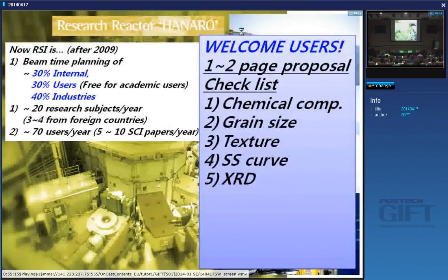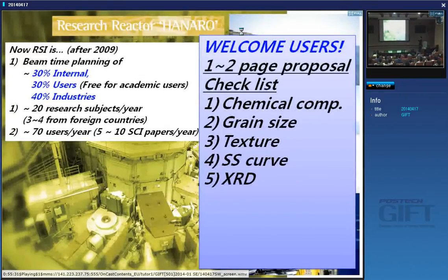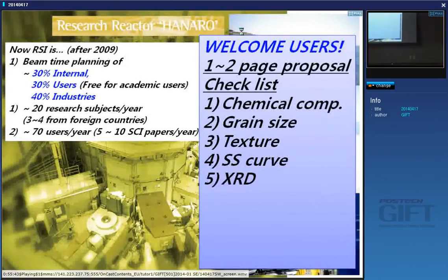I want to, every user is welcome, okay? It's free. I mean, if you submit one or two, very brief, do not need to be long, very brief proposals, I will just go first come, first served, okay? So please check your material, chemical composition. I want to know the phase, BCC, BCT, or FCC. I want to know phase composition and grain size.